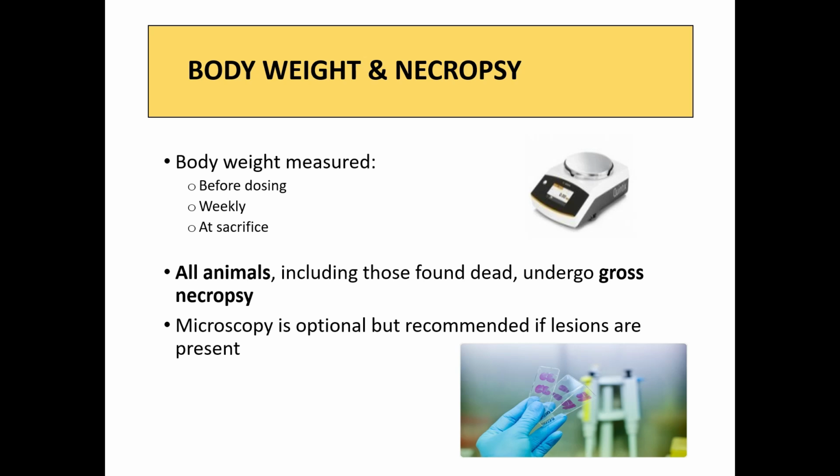All the animals, including those found dead, undergo gross necropsy. Microscopy is optional but recommended if lesions are present. You can go for histopathology if you find lesions are more severe in the animals.